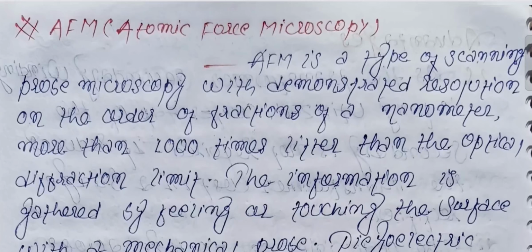Friends, today we learn about AFM, Atomic Force Microscopy. Let's learn, friends. AFM is a type of scanning probe microscopy with demonstrated resolution on the order of fractions of a nanometer, more than 1000 times better than the optical diffraction limit.